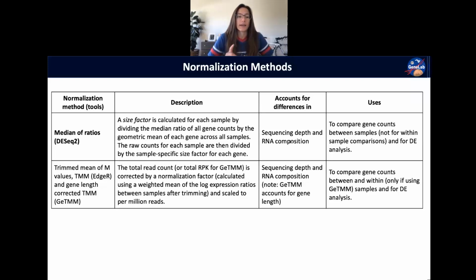One thing to note about that though, the tximport tool that I had told you guys about, that we use in our usual pipeline at GeneLab: we pull in the genes.results files directly into R using tximport. When you do that, it actually normalizes based on gene length, using the effective gene length from the RSEM genes.results file.